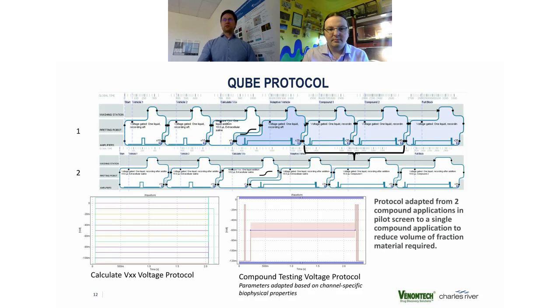We typically always use a couple of liquid periods of just adding our vehicle, our external buffer, letting the seals and current amplitude stabilize. And for these experiments, we use the adaptive voltage protocols. In these, we have an online Boltzmann fit shown in the bottom left corner here, which measures for each well the V half of inactivation.